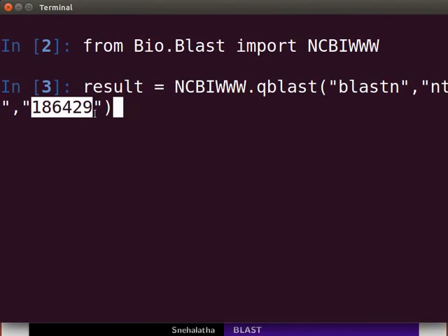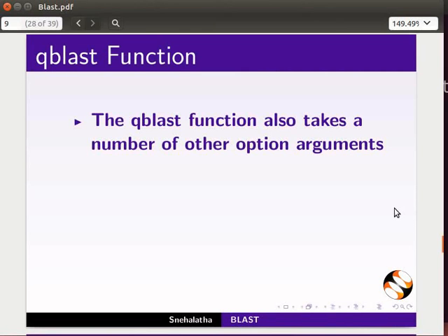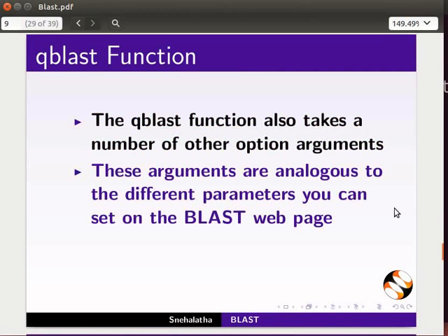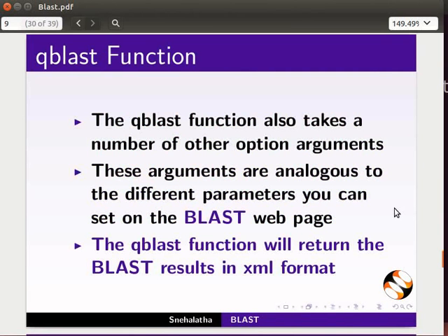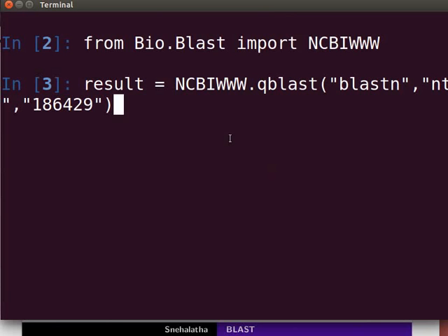For this demonstration, I am using the GI number for a nucleotide sequence — specifically the GI number for a nucleotide sequence of insulin. The QBLAST function also takes a number of other optional arguments, analogous to the different parameters you can set on the BLAST webpage. The QBLAST function will return the BLAST results in XML format. Since our query is a nucleotide, we will use the BLASTN program, and NT refers to the nucleotide database.